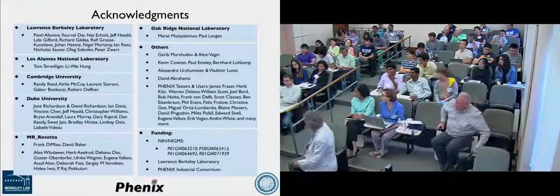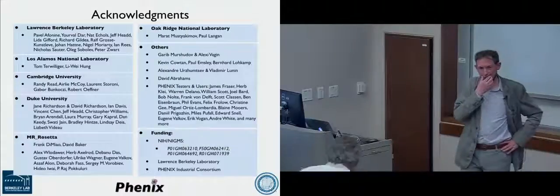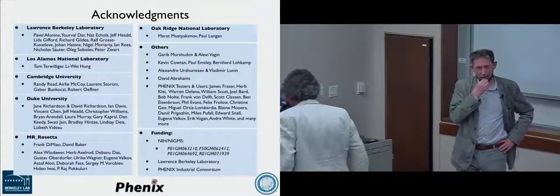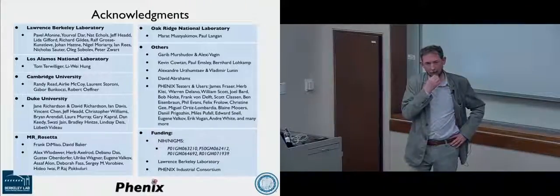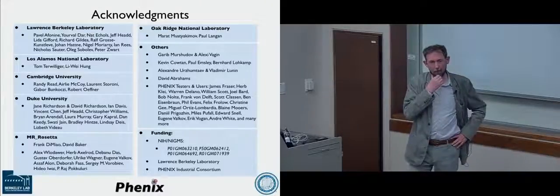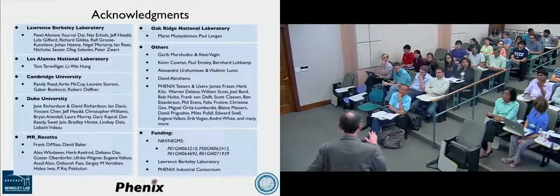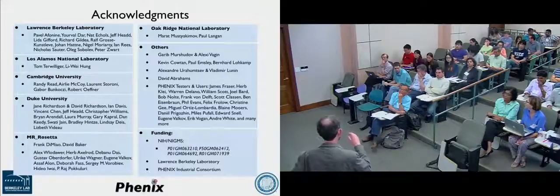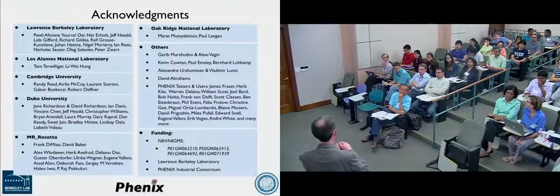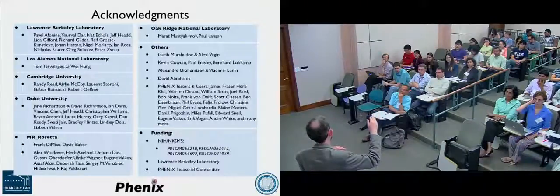The model we look at, it's really good in real space. So despite the fact that the high resolution phases are not good, if you just take low resolution phases, they should be very good. And if you just take them and use phase extension, and forget about the model, maybe you can get a good result from this. Historically, Tom could say more, but the experience is you can't really extend from very low resolution phases to high resolution.